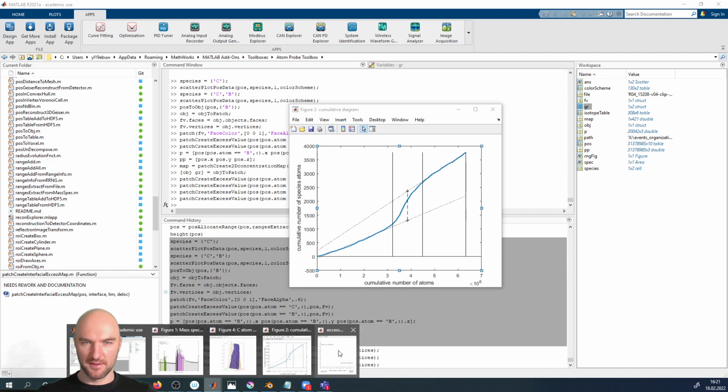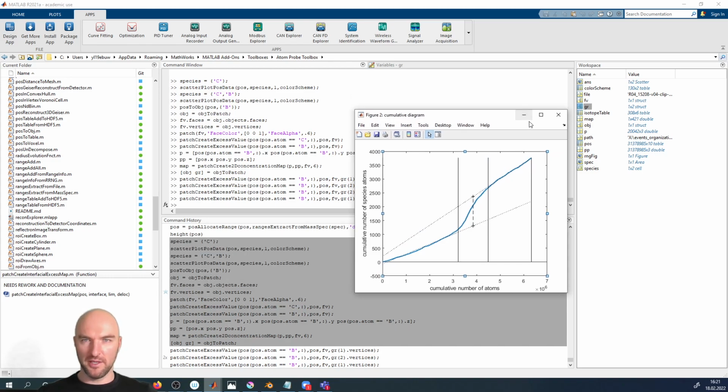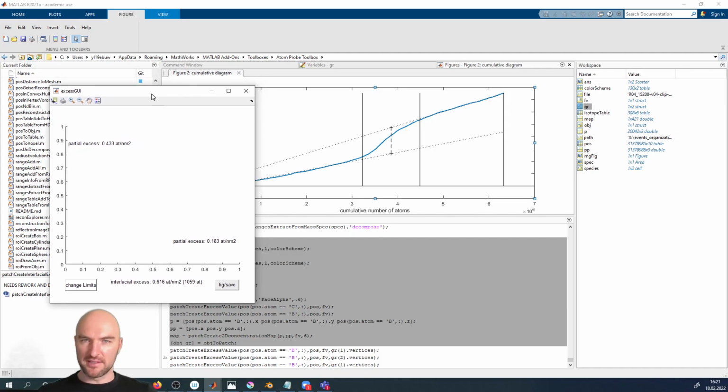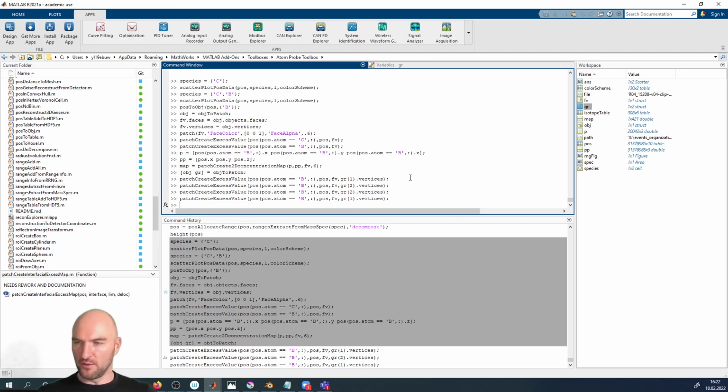Did it? That is weird. I really have to check on what in God's good name is going on here. Anyway, so here we've got 0.6 atoms per square nanometer, and on the early one we had about 1 atom per square nanometer. Maybe we'll just redo the interface here to bring it into the 21st century. It's fully functioning, no errors or anything, but this could be a little bit prettier.